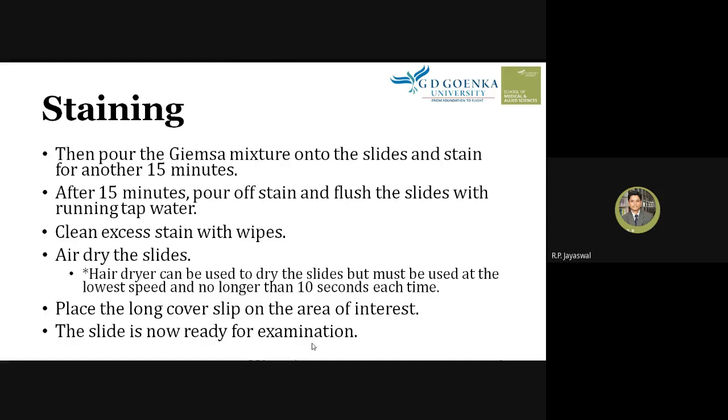So this is the procedure we have studied. There are different steps, and the procedure is very easy. First of all, you stain with the May Grunwald stain for 10 minutes. Then you wash off the stain. Then you pour another stain, the Giemsa stain, which is diluted, for 15 minutes.